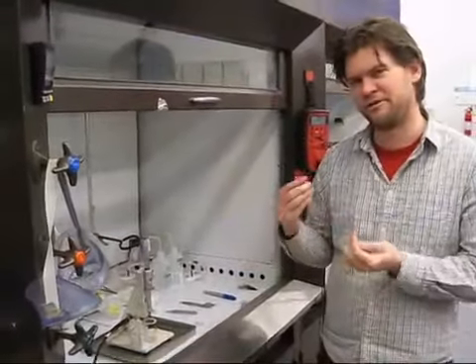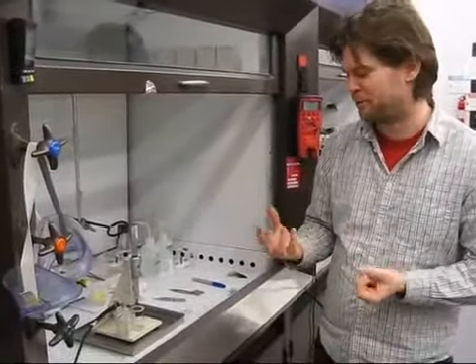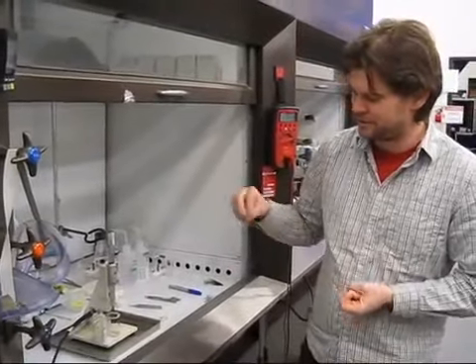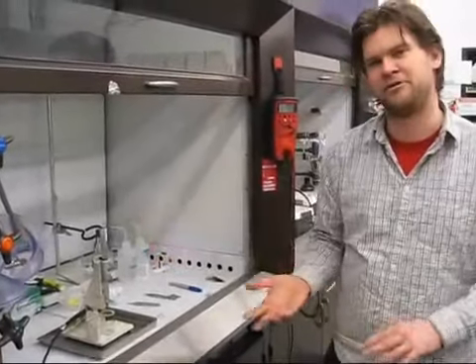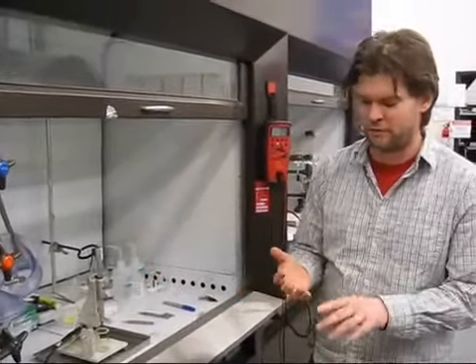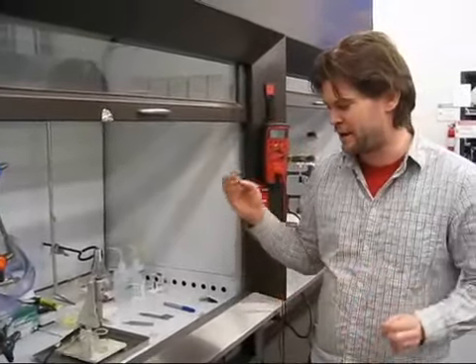Okay, so we're going to use these metal probes for the near field imaging. What we'll normally start out with is a chemical etch, and the chemical etch itself will be specific to whatever metal you want to use. You can use silver, gold, tungsten, whatever kind of noble metals you want to do the imaging with.